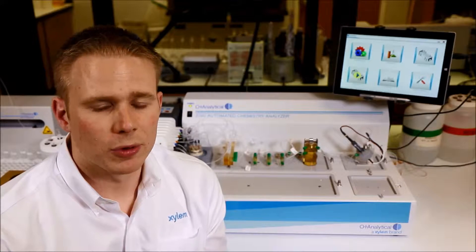In addition to this, we also have available on this platform ASTM D6888 and OIA 1677, both of these methods for available cyanide, ASTM D7237 for free cyanide, and the standard EPA 335.4 post-distillation cyanide with phonometric detection.